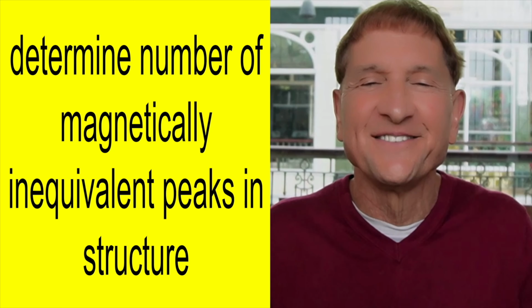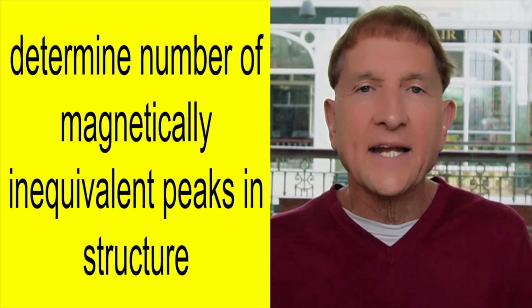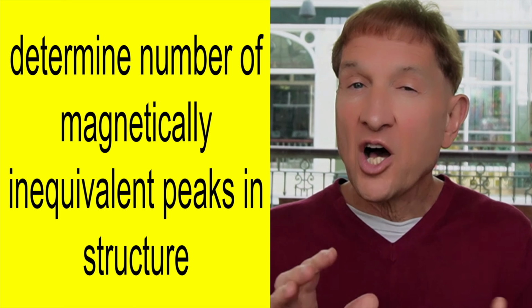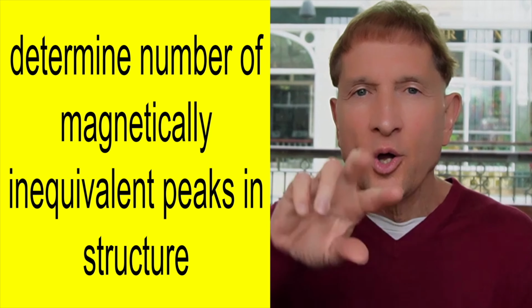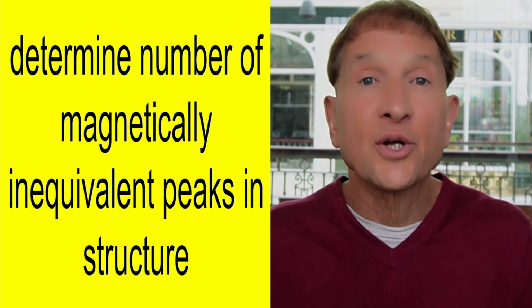But before you do that, let's look at a relatively underappreciated step that will increase chances of success. I call it a secret sauce. That is, learn how to predict the number of magnetically inequivalent carbons in a molecule. Carbons that can be interchanged by an axis of symmetry or by rotation around a line of symmetry are equivalent.